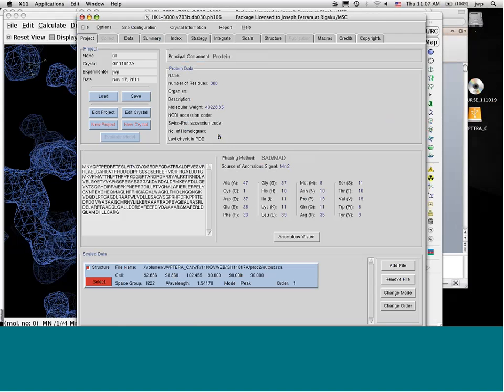So what you might do to help phasing, and I didn't do this here, is to go back and complete the anomalous substructure by looking at anomalous difference Fouriers and plugging it in. And I know that Randy Read has his Phaser package now through the CCP4 interface, which goes back and looks at the log likelihood gradient map and will look for secondary, more sites than SHELX found, fill them in, and do phasing that way.